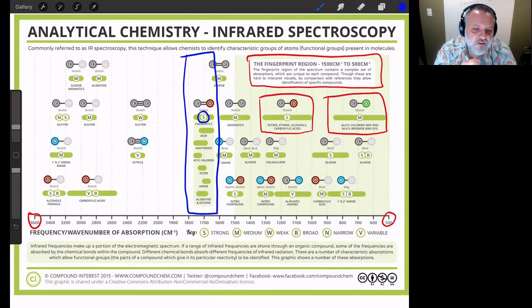You get carbons that have triple bonds, whether they're to other carbons or to nitrogens. Those signals are particularly easy to identify because they're the only things that really appear in this category. Even though it's a weak signal, you should still be able to see it because it's not going to be buried under other signals. It'll be apparent.